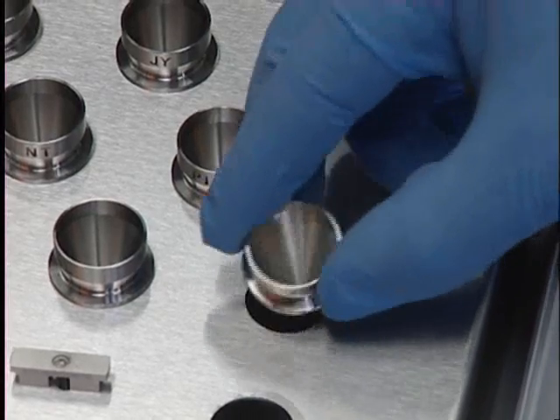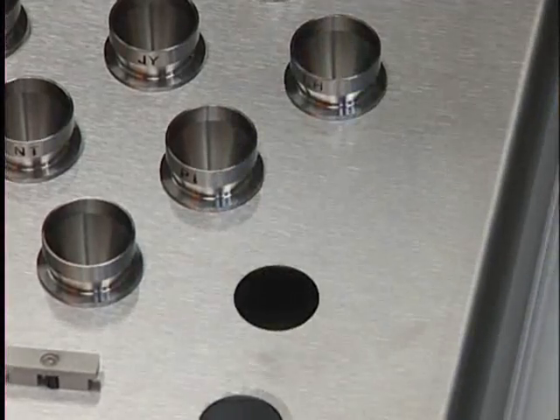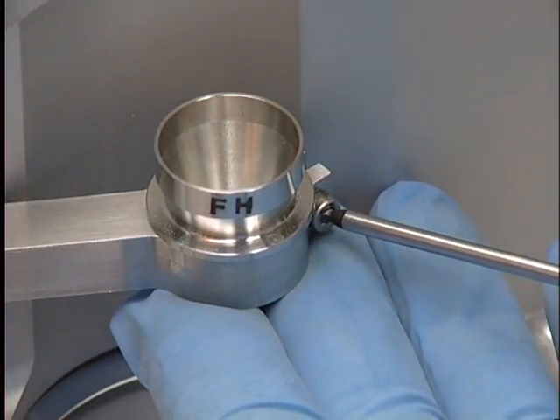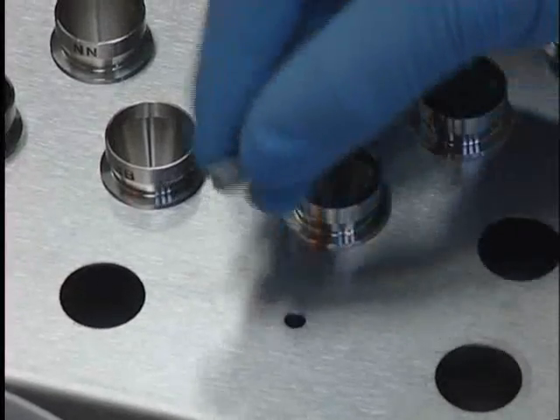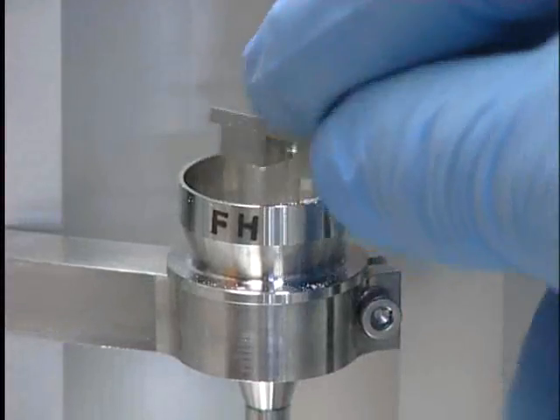A dispense head, suitable for the type of powder, granules or beads to be filled, is selected and fitted onto the system. Drug powder is filled into the dispense head. For cohesive products, the fingers are inserted to maintain smooth product flow.